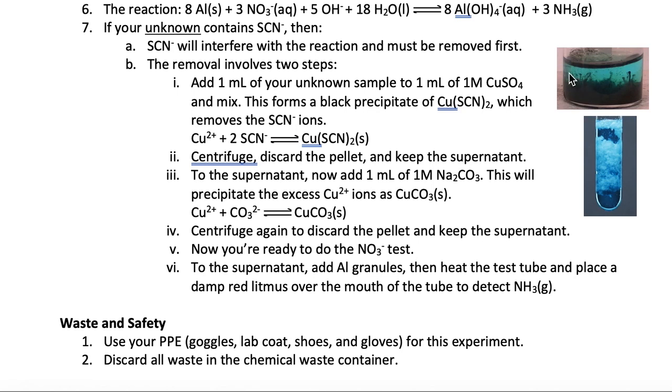Now, since you have excess copper in the solution, you're going to have to remove the copper by adding sodium carbonate. The copper and the carbonate combine to form copper carbonate, which is a solid as shown here. You then centrifuge this test tube once more to remove the pellet. Now you can test the supernatant for nitrate ion.